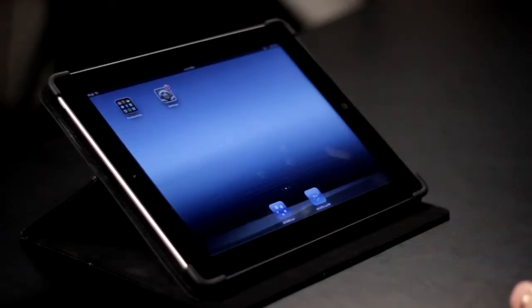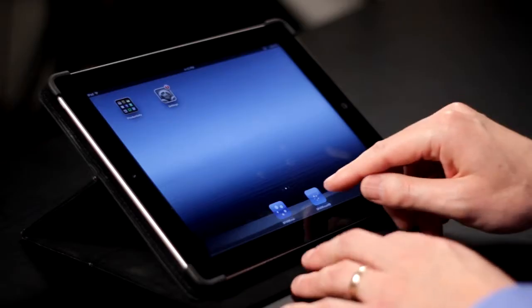It's a great new feature that can be used with or without a sensor. This video will show you how to make a bar graph without a sensor, and the other video will show you how to make bar graphs with a sensor. Today I'm going to be using SPARKvue HD for tablets, for the iPad, and for certain Android devices, but you need to know that the same software that I'm showing you works the same on smartboards, computers, and even in our Spark Science Learning System handheld device.